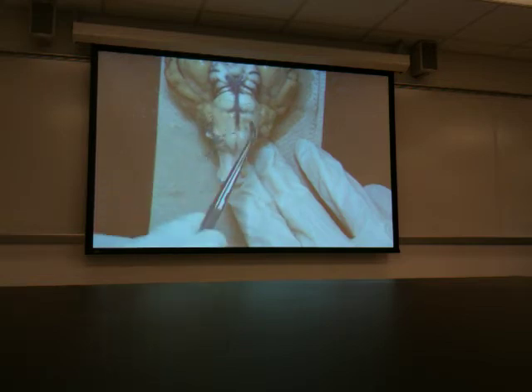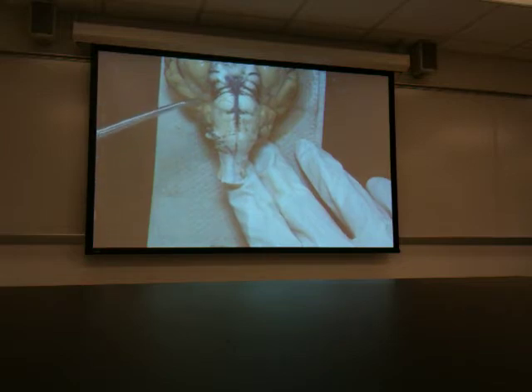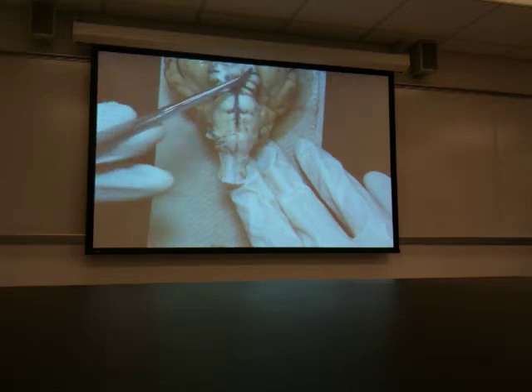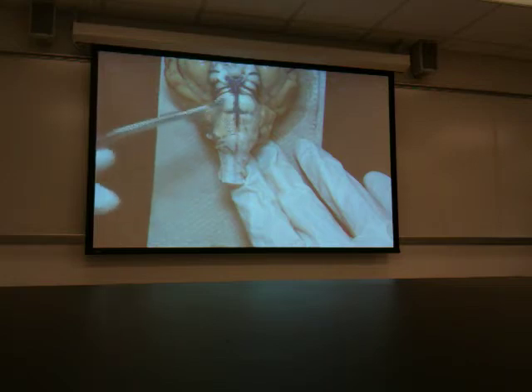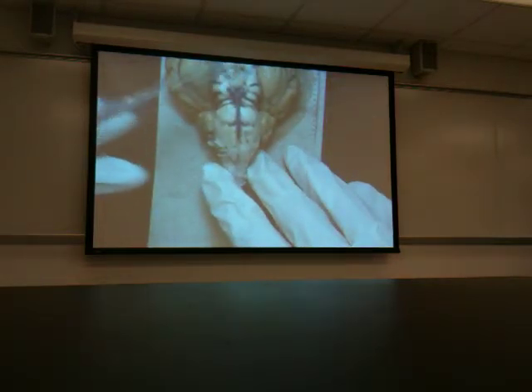Okay, we do have pons, we do have medulla oblongata, we have the trapezoid body here, we have the medullary pyramids here. What does your book call it? Medullary pyramids or pyramidal tract or what? Wait, where are the medullary? Okay. Medulla oblongata here. Now I'm going to move fast, but it's going to be a broken record that eventually you're just going to understand absolutely everything I say. The white tissue up underneath here is the cerebral peduncles. These are the pons. This is the pons here. Of course, we have the optic chiasm. Again, optic tracts, optic nerves are cut off.